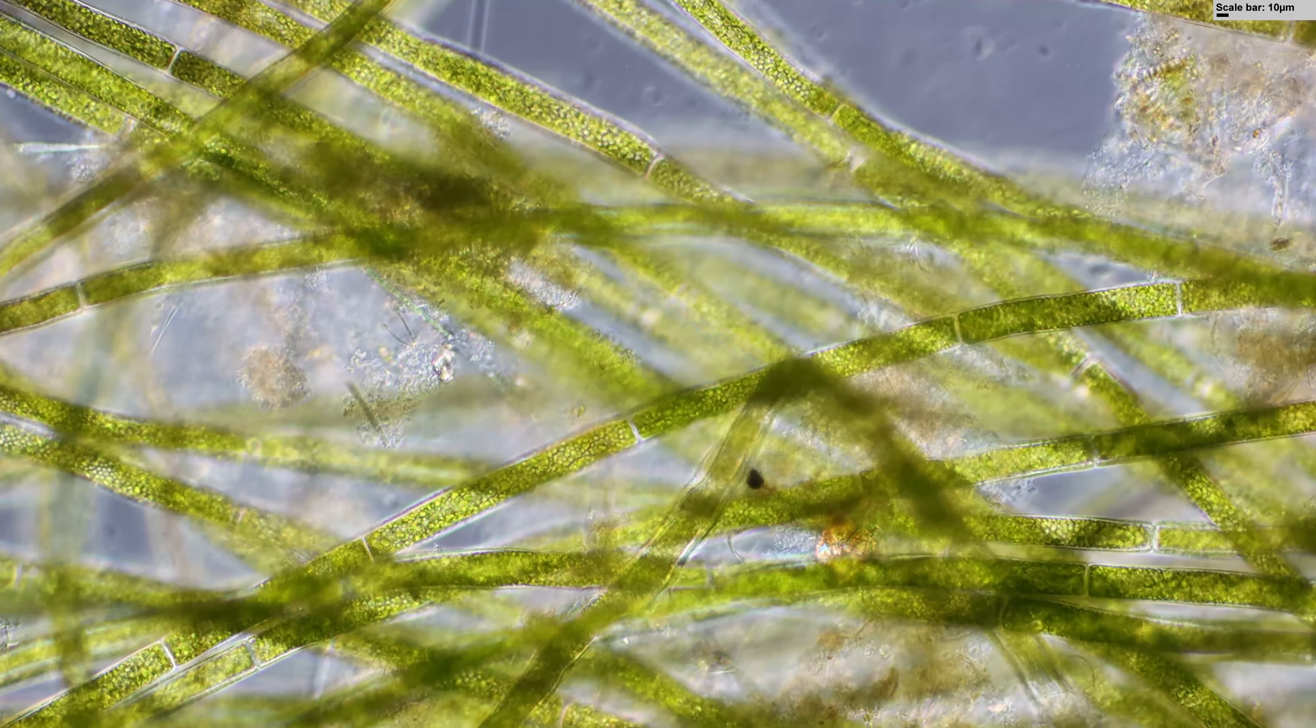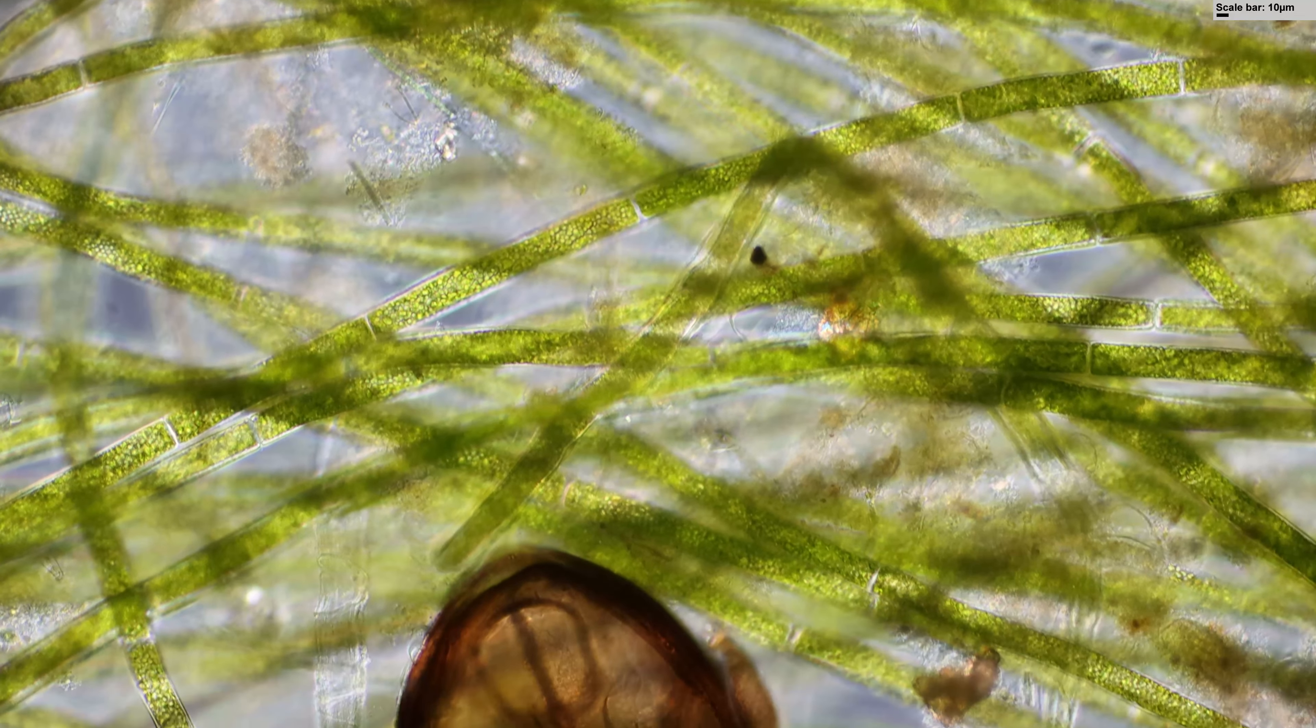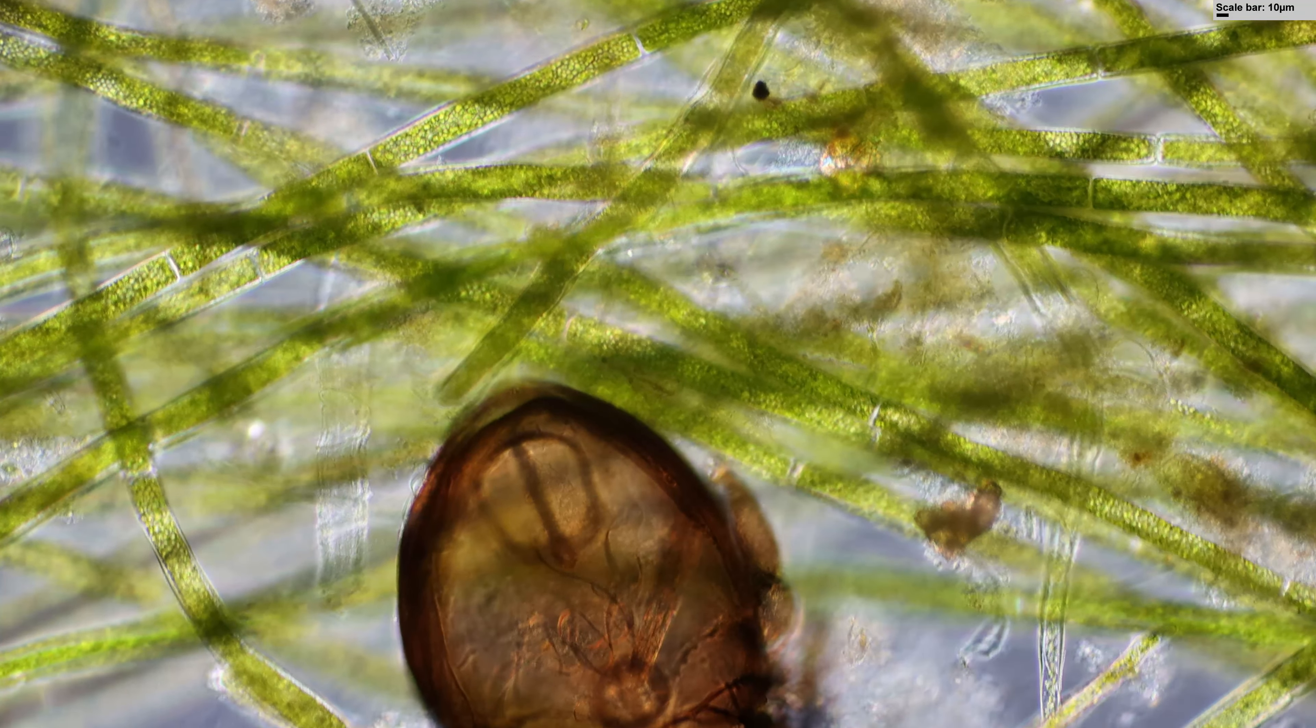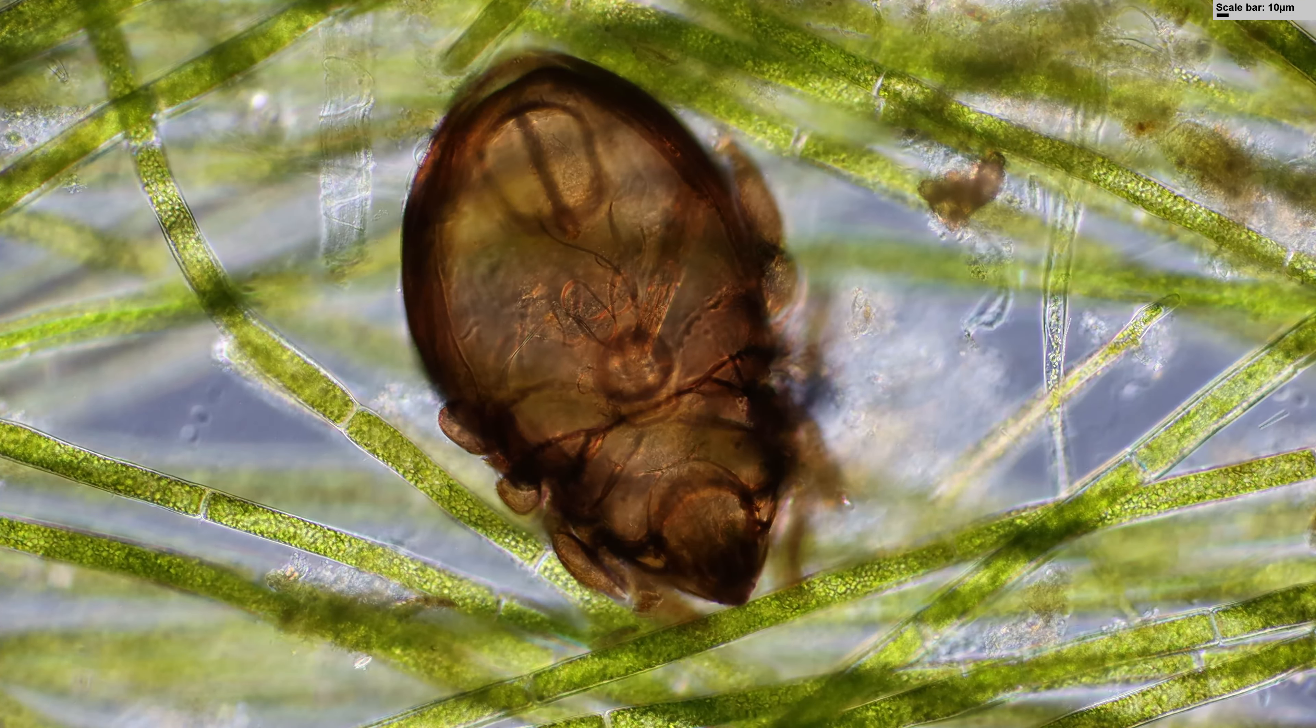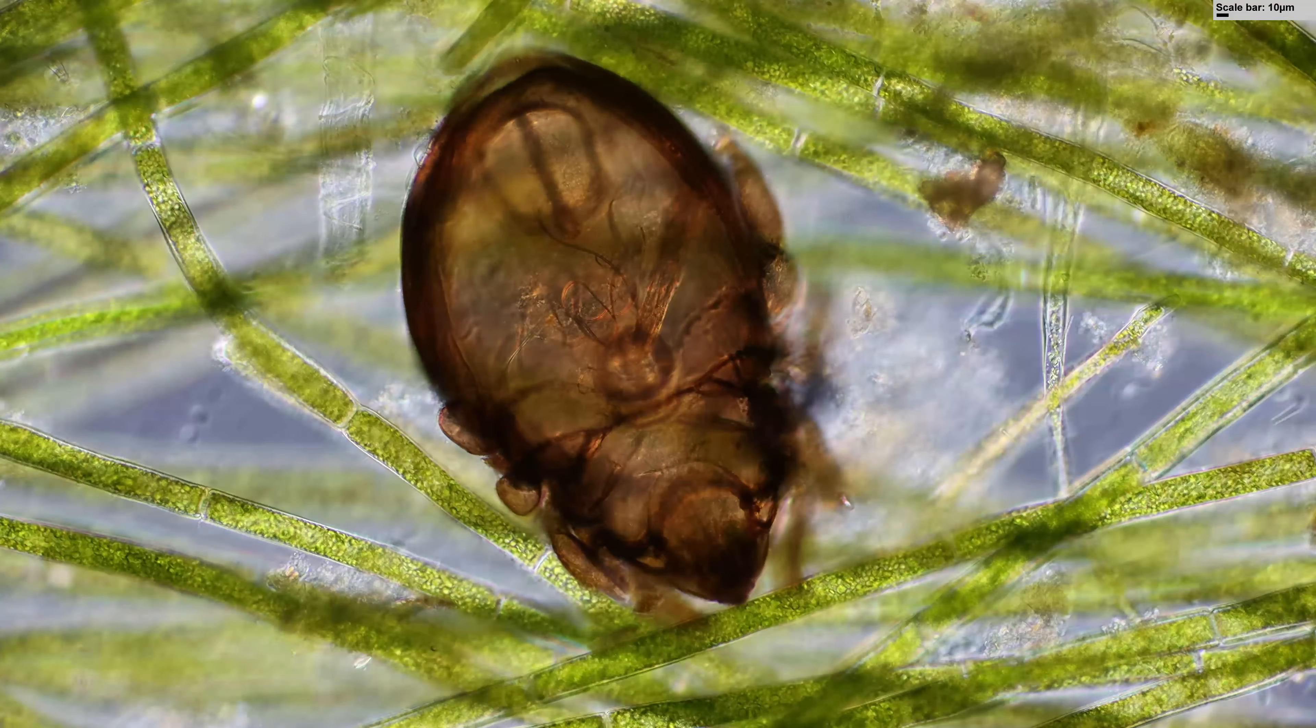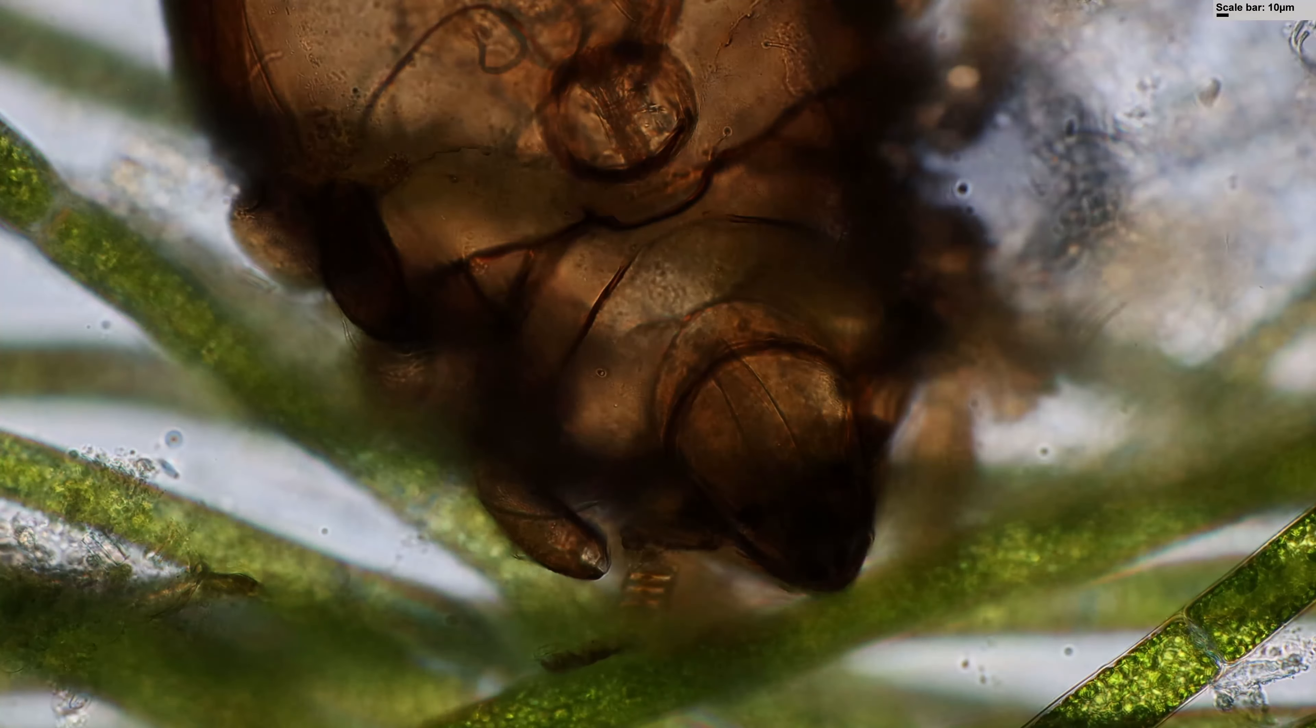When I put those algae under the microscope, I did not only find a whole bunch of ciliates and rotifers, but also, surprise, a mite—a microscopic mite. This kind of shows that the algae is also the habitat, the place where many other animals, microscopic animals, are able to live.